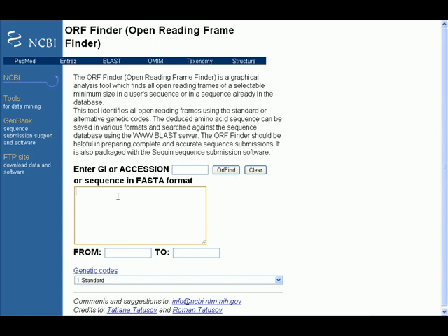You should know that this software is very basic. So in this tutorial I'm going to use a microbial sequence which is a sequence from a bacterial genome because higher organisms have very complex genes.